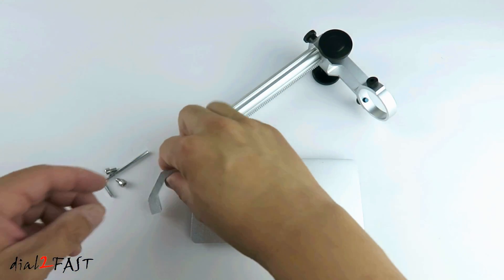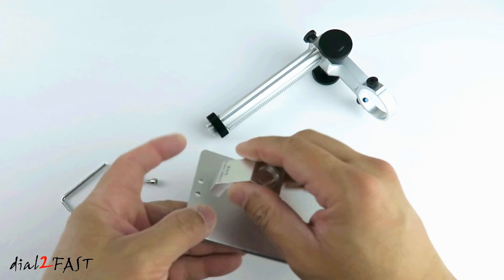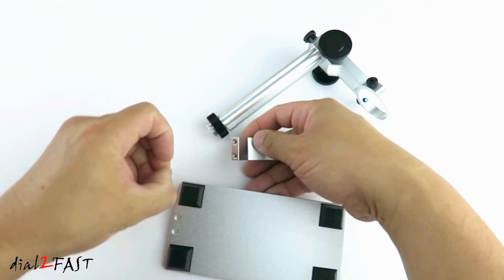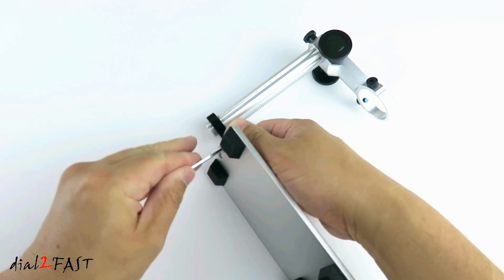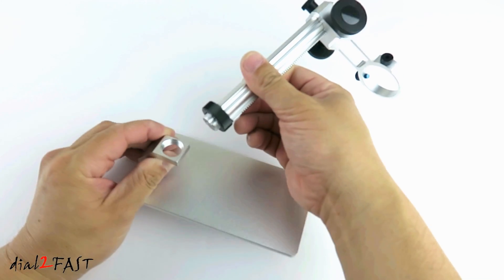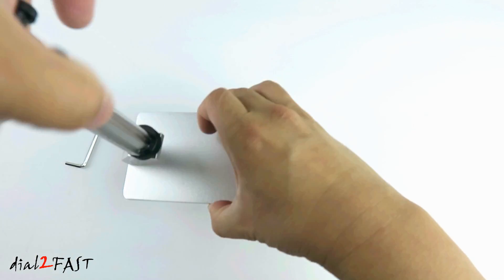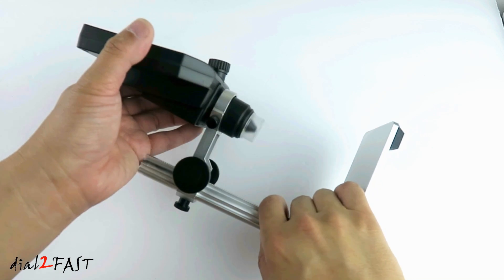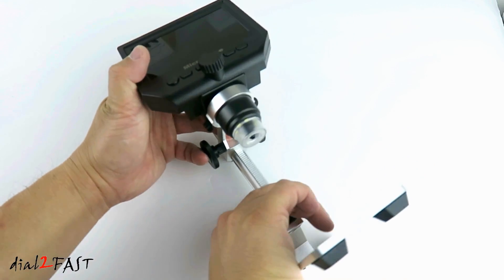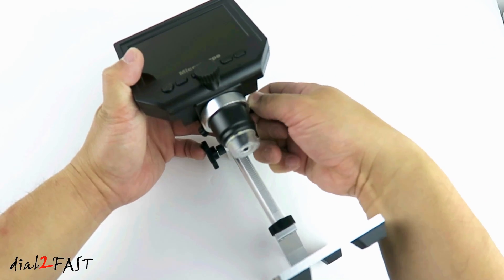Let's assemble the stand. Take this bracket and these screws and we'll mount it to the base right here. Now take the stand and we'll screw it in right here. Place the microscope into the stand — there are two screws on the side that you can tighten to hold it in place.